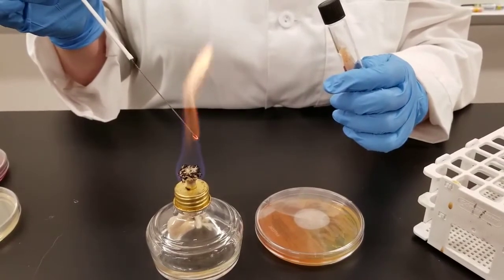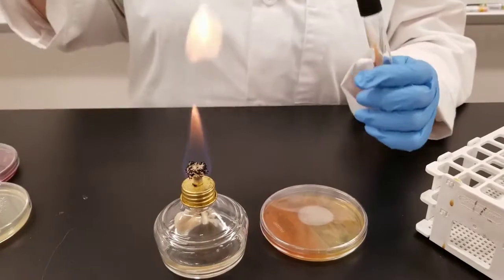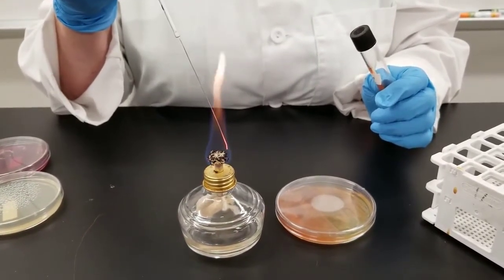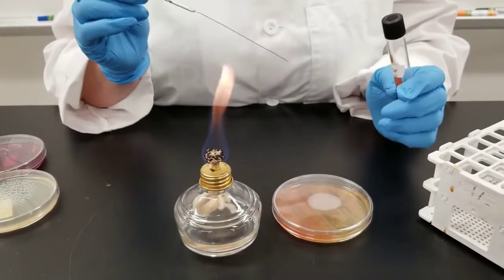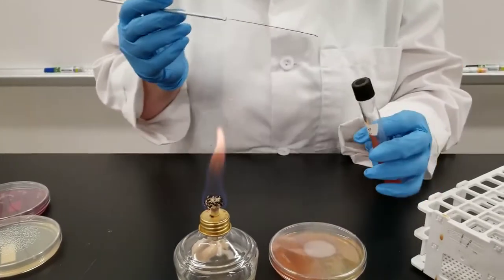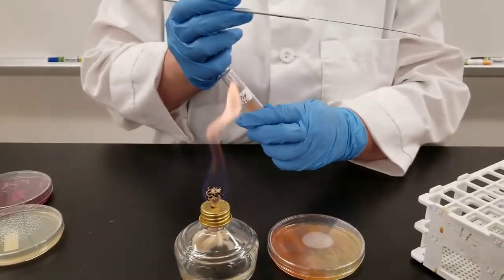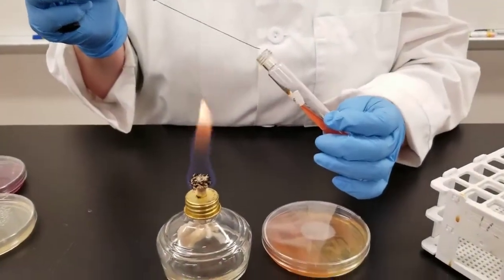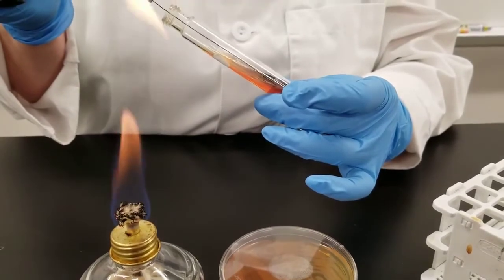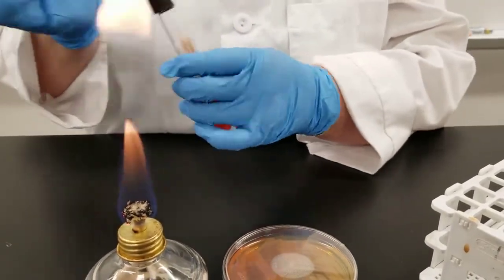Now we're going to do something a little different. We are done with the loop for right now. Now we are going to use the straight needle. Flame it just like you would your loop. When this cools off, we are going to touch the colony again on our stock plate. This time we're going to do a stab down into the bottom part of the tube, which is referred to as the butt of the tube. Flame our tube, then take the needle straight in, down, back up. Flame the needle again.